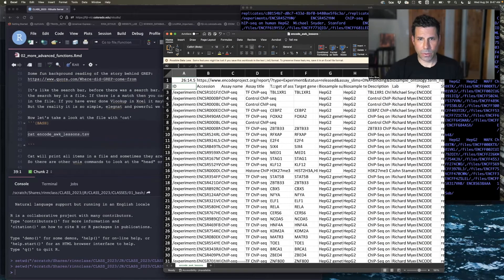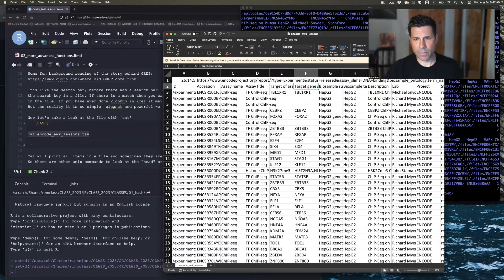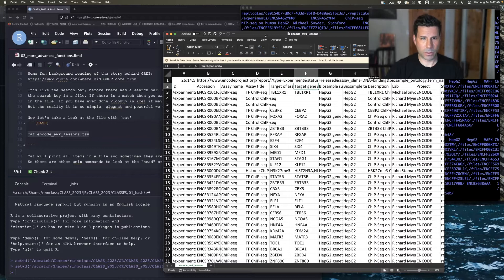Here's what we're really going to be looking at — column six: one, two, three, four, five, six — the target gene here. These are all gene names for different proteins that have been used in this ChIP experiment.